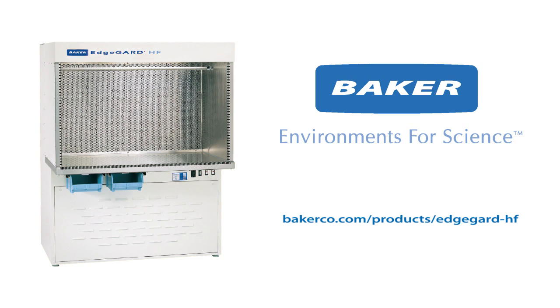For more information on how the EdgeGuard HF provides maximum protection for your work, please visit our website.